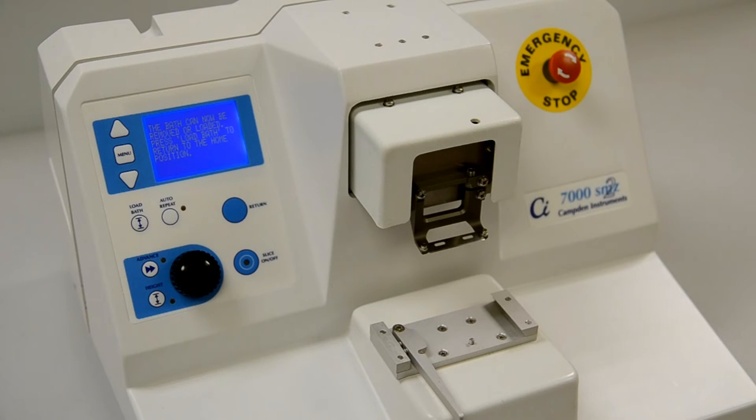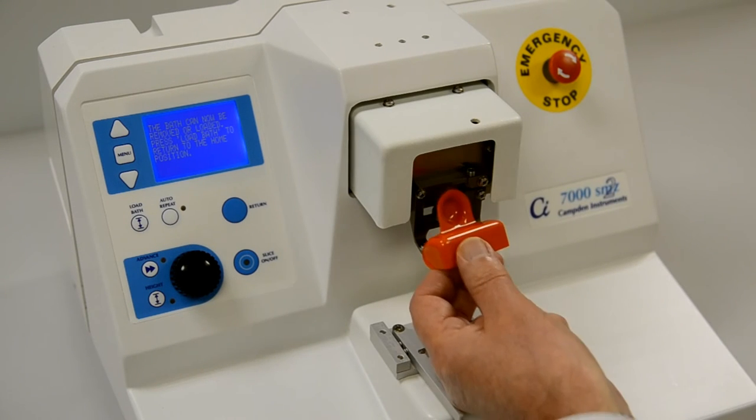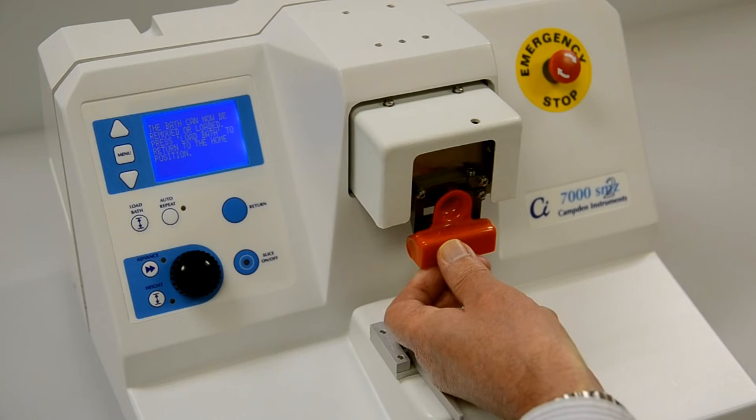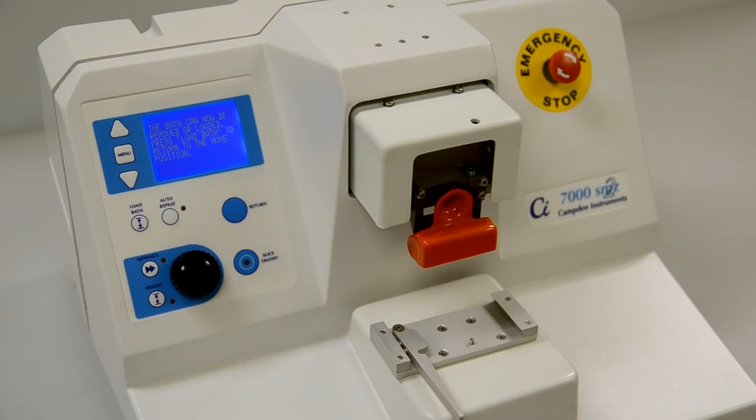Replacement screws, washers, and complete blade holders are all available from Camden Instruments. Consult your operator's manual for the correct part number. For operator safety, each instrument is supplied with a removable blade guard. This is easily fitted and removed as it is simply held in place with a magnet. Once it is in place, it will protect the operator from accidental cuts and also protect the blade edge from damage.